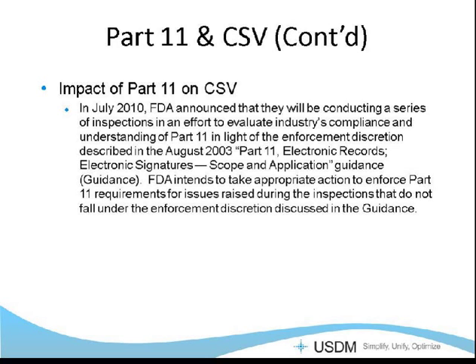In addition, impact of Part 11 on computer systems validation. In July 2010, the FDA announced that they will be conducting a series of inspections in an effort to evaluate how industry is complying and understanding Part 11. And so they have piggybacked a large number of newly hired computer science degreed inspectors onto the regular inspections. So they're trying to see how laboratories, manufacturing facilities, medical device companies are actually interpreting and applying Part 11.